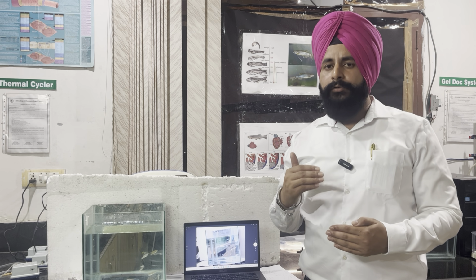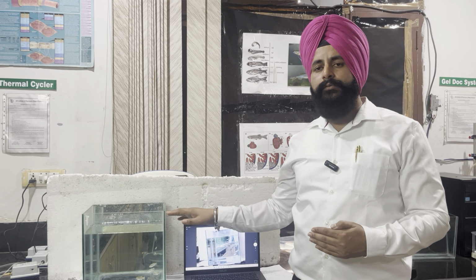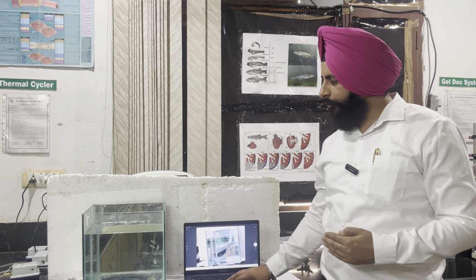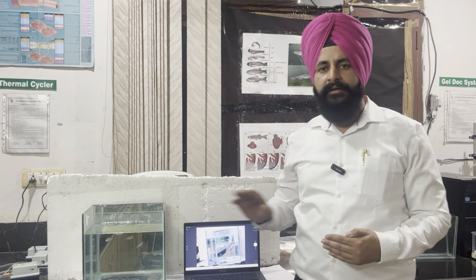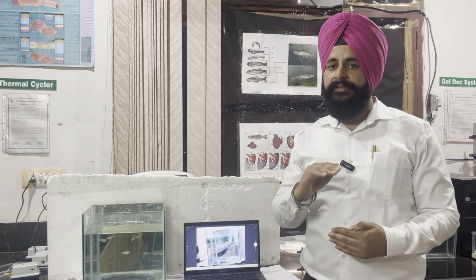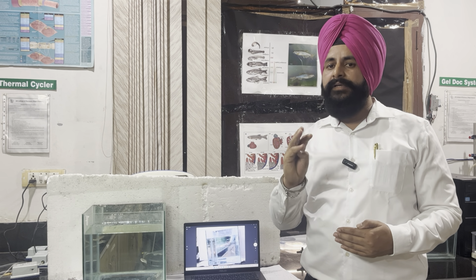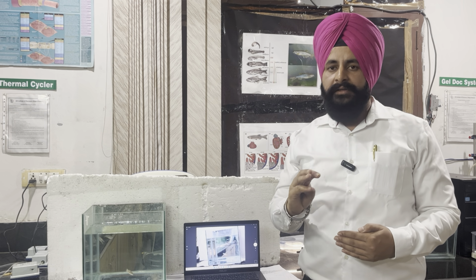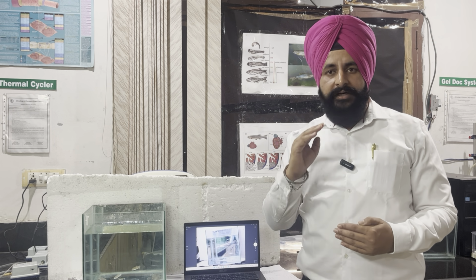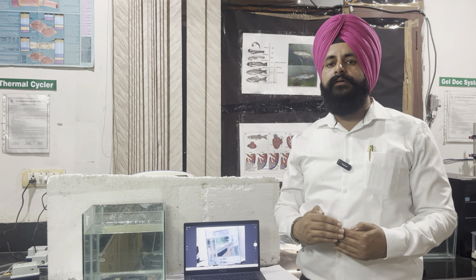The second thing is the environment you are providing to your zebrafish. The normal temperature of the water where you have placed the zebrafish should be around 25 degrees centigrade plus minus 2 degrees centigrade. The humidity range should be around 50 to 60%. And the third thing, a dark and light cycle should be maintained, divided into 14 and 10 hours. So these are the physical stimuli which can be responsible for anxiety.